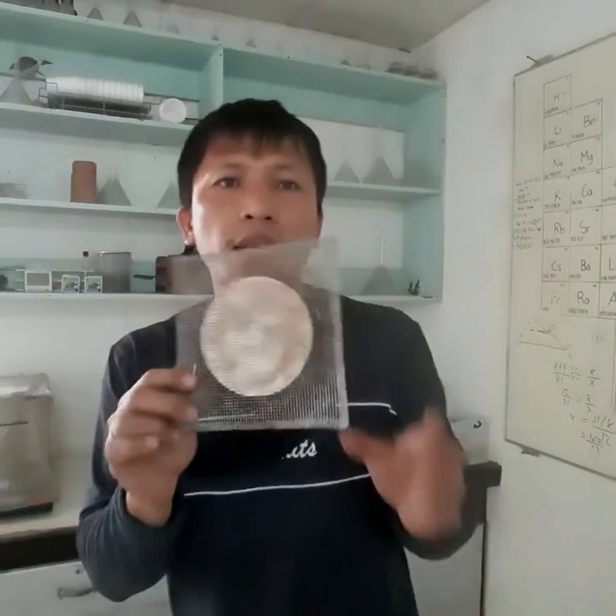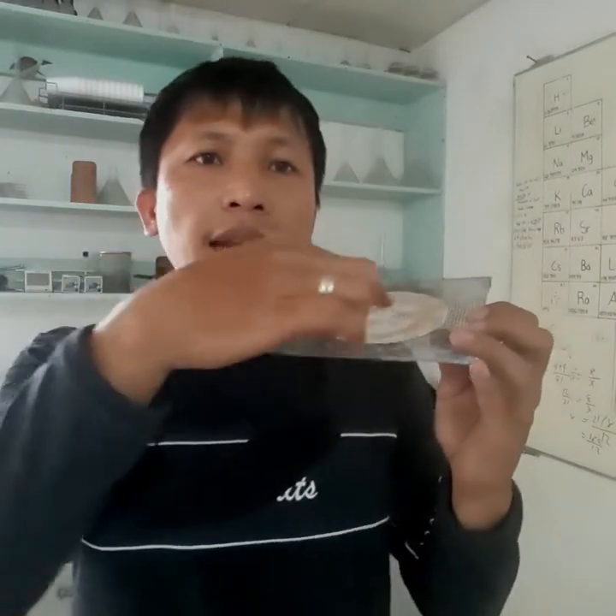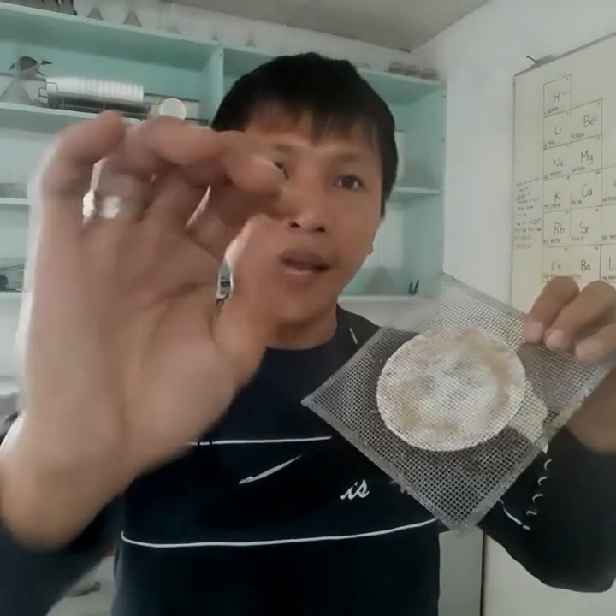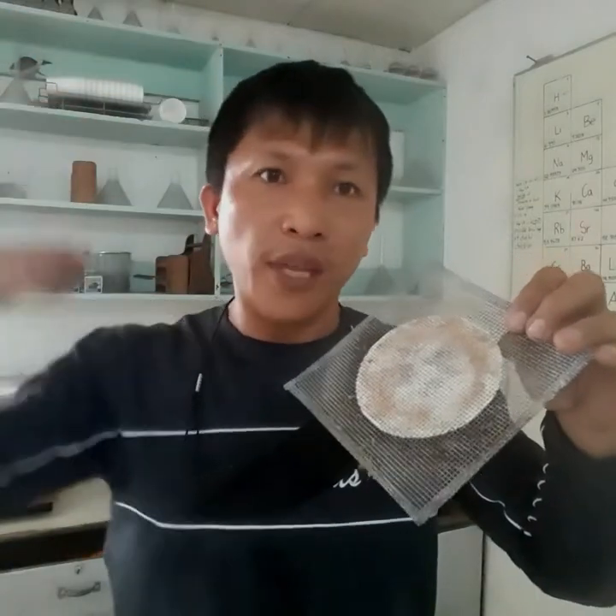Asbestos on your wire gauze usually distributes the direct flame to your beakers or flasks. So that's the use of this one — for your direct fire to be distributed. It is not good for your fire to come in contact with your glass, even though it is Pyrex. Sometimes you can use that, but it's not really advisable, because even though it's Pyrex, it really has some breaking point.